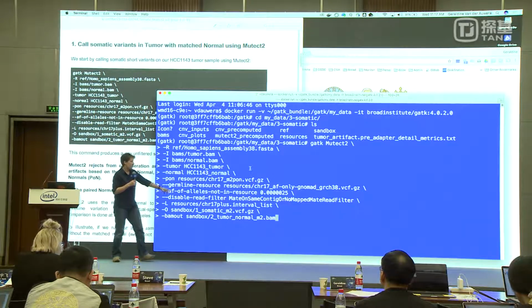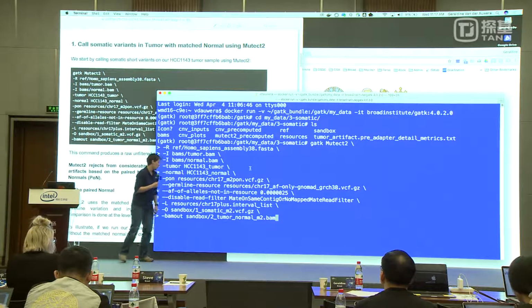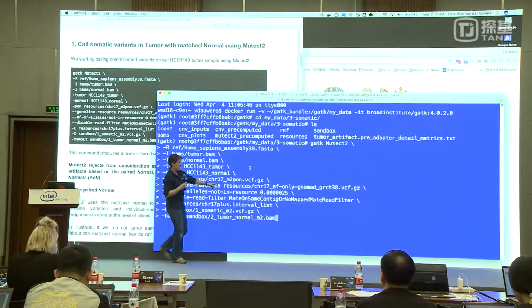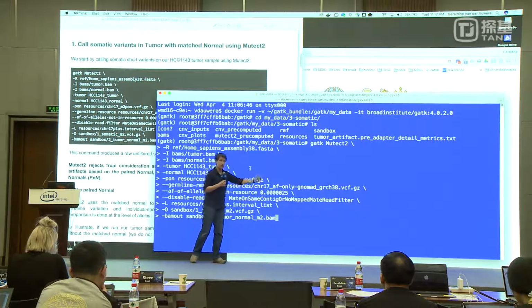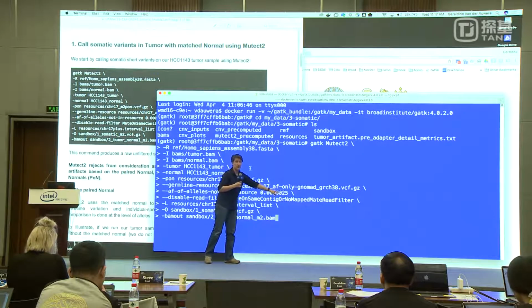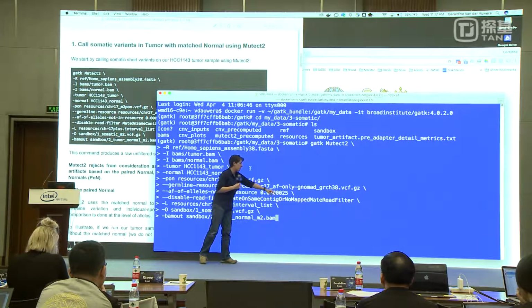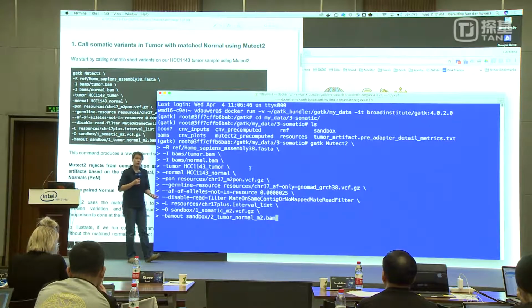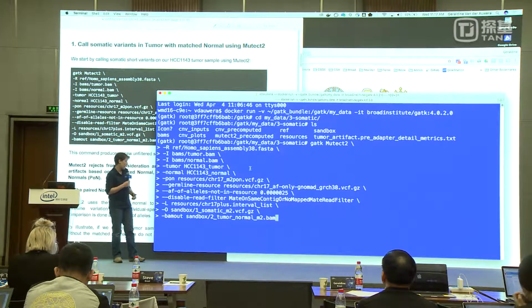Okay, so at this point, we're basically saying if we didn't see it in gnomAD, it's that rare. You can expect that as gnomAD increases, as newer versions of the resource get released, we will need to adapt that number appropriately. So this is not a fixed number in time. This will change over time as the resource increases. Or if you choose to use a different resource, you will need to adapt it accordingly. Okay? So that's your AF for things that are not found in the resource.